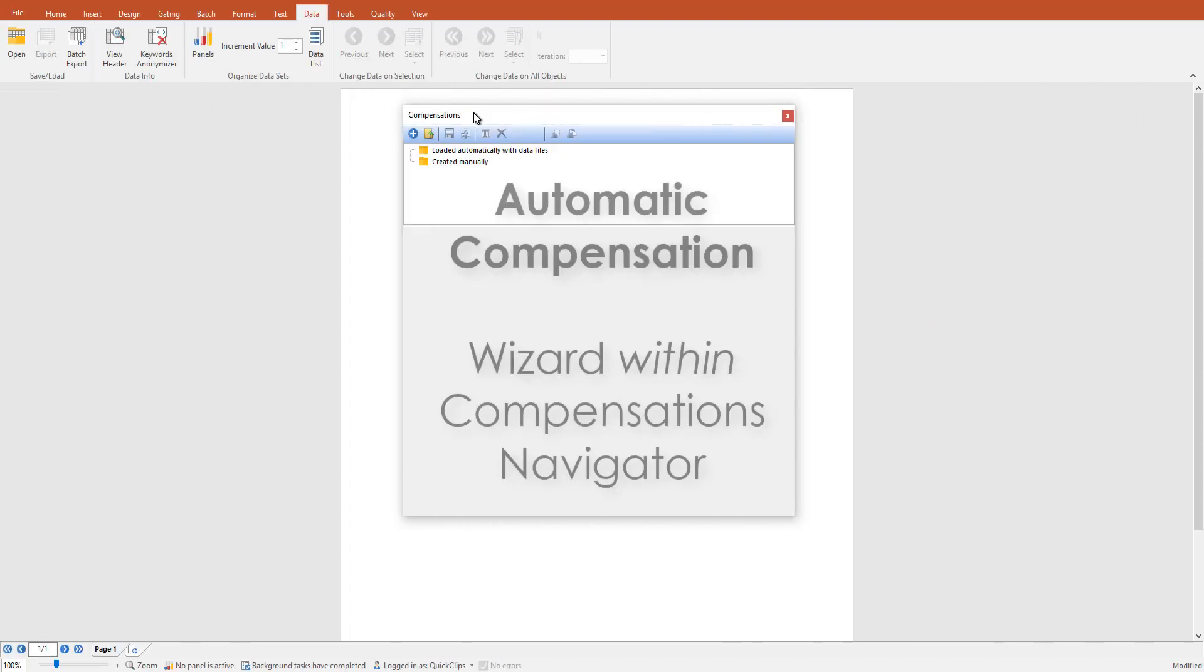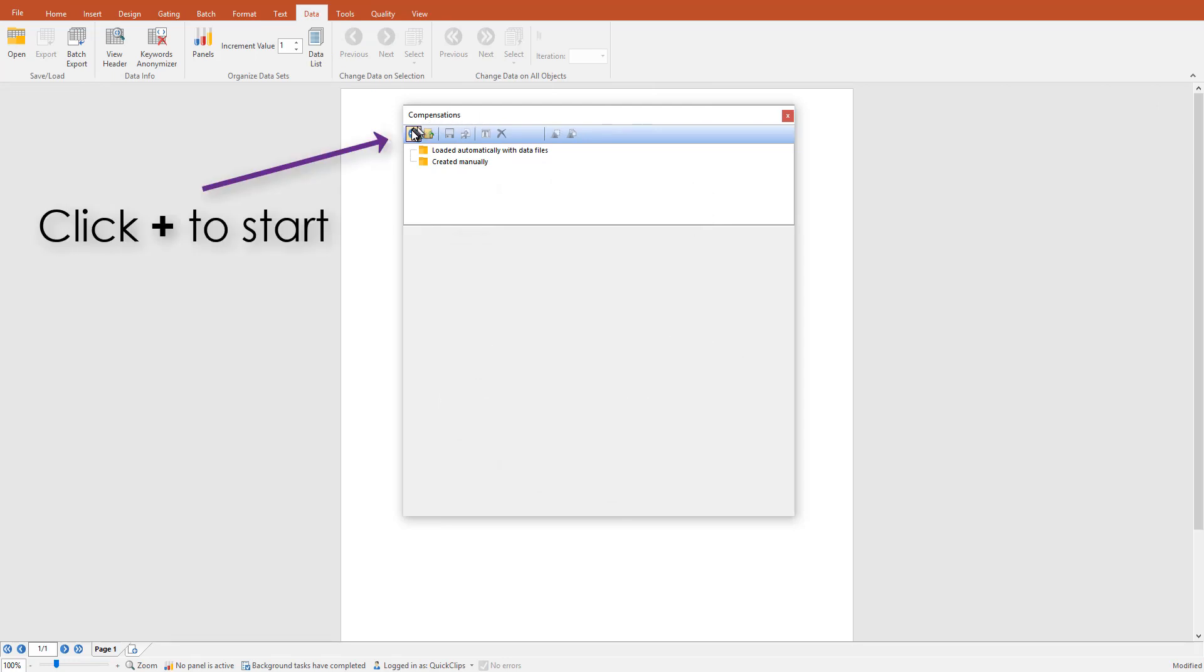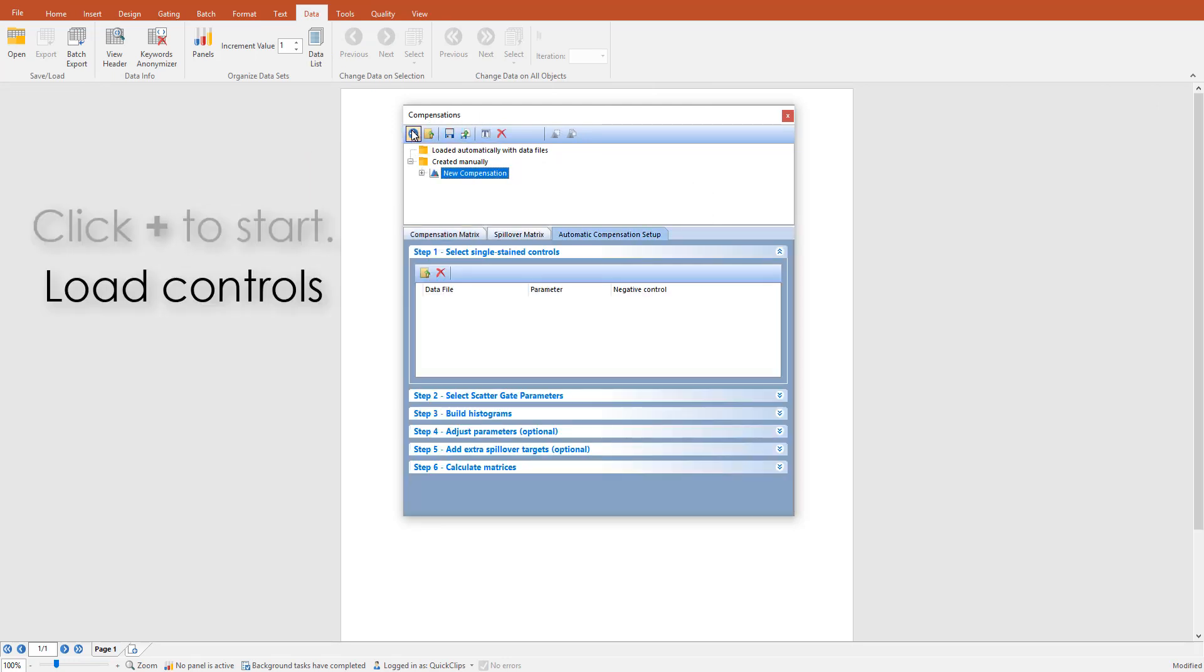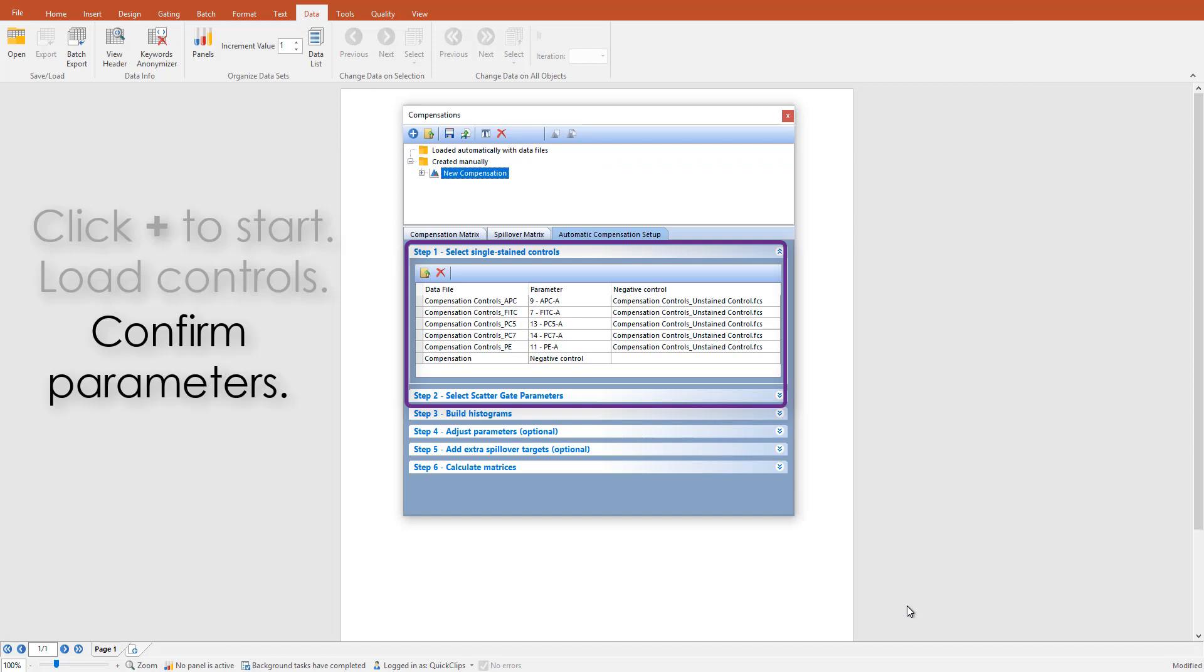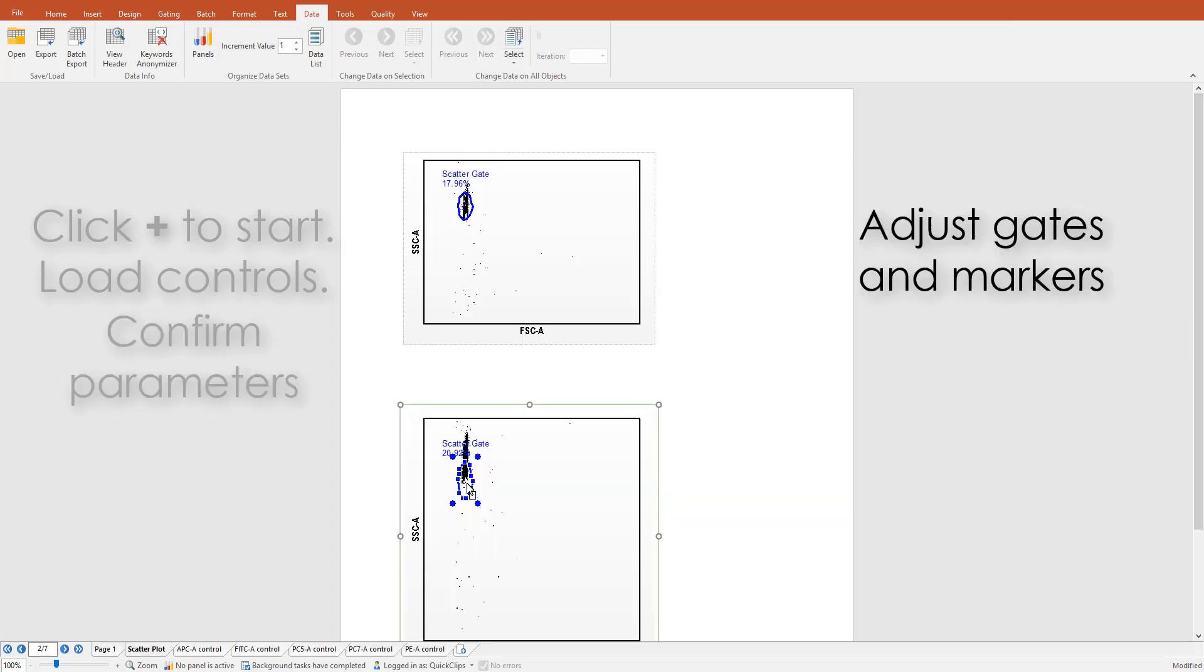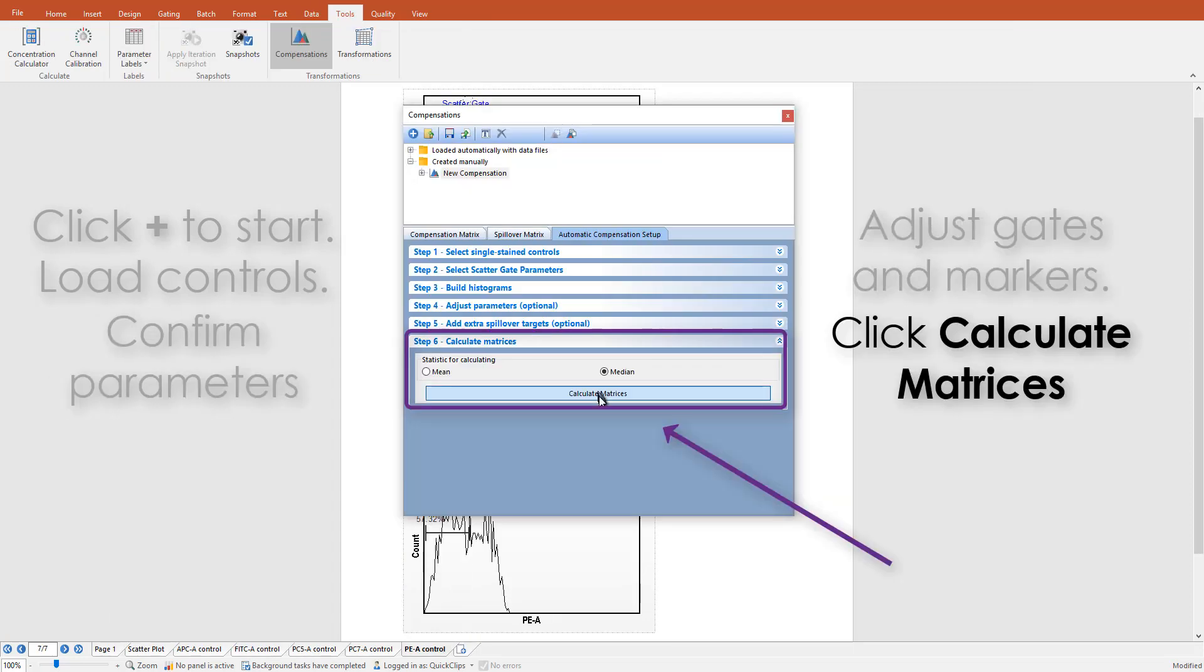Use the wizard to create new compensation matrices quickly. Load the single-stained control data files, confirm parameters, adjust gates and markers to define populations to calculate compensation, and click Calculate.